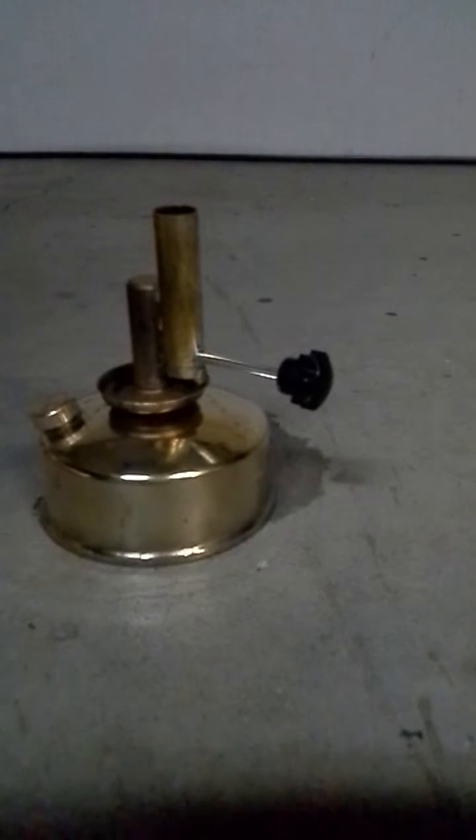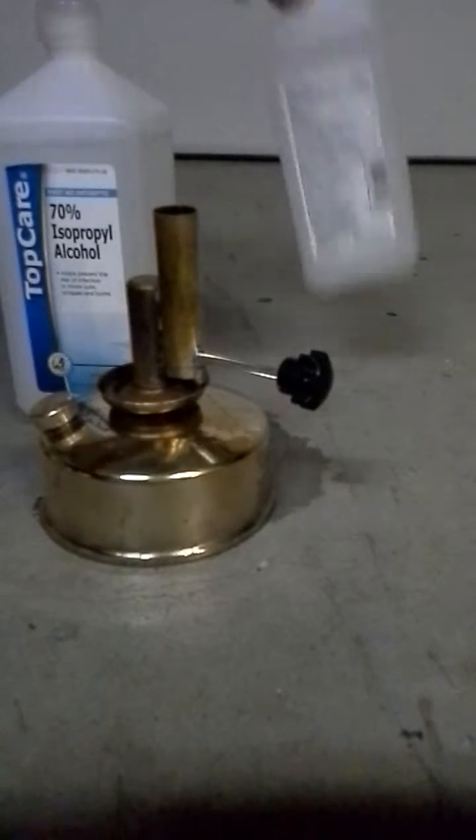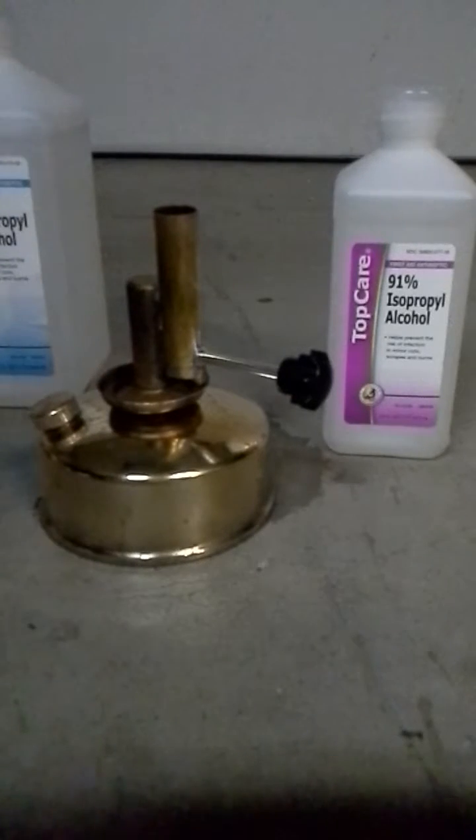Hi YouTubers, this is my first video and probably my last. It takes a lot for me to want to say something in front of people, let alone record it. We got 70% alcohol, 91% alcohol. This is a burner that I got from the Wish app, or Geek app, whatever the fuck you call it.